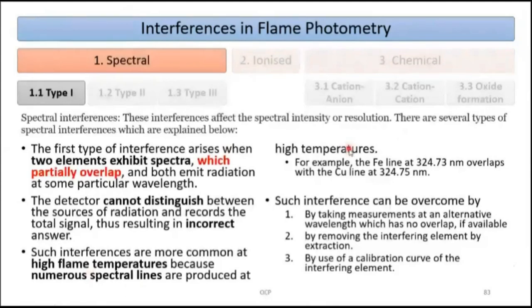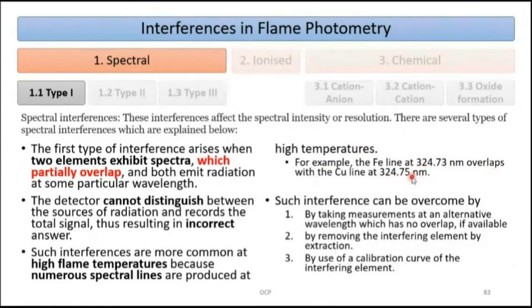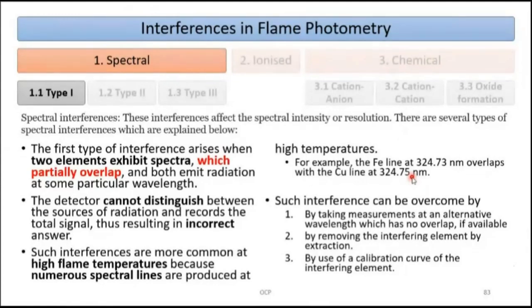Such interferences are more common at high flame temperature because numerous spectral lines are produced. For example, the iron line at 324.73 nm overlaps with the copper line at 324.75 nm. Since iron and copper each have other lines at different wavelengths, the solution is to select an alternative wavelength with no overlap.